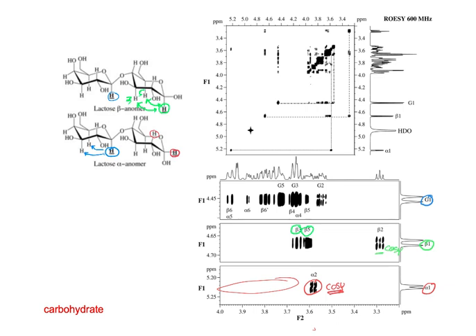I found an answer. It's rough. Max roughly is about four angstroms for NOE. Okay, that makes sense. I was thinking maybe 5 or something, but 4 is about the same range. And I don't know for these 1,3 diaxial interactions what the different distance is there.